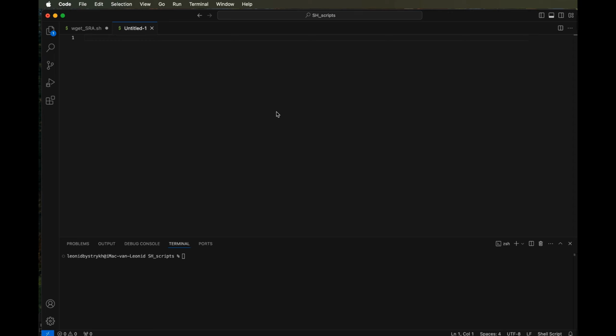Then you have to know some basic elements: command line, then defining variables, then how to do a reference to the variables. For instance, you write a dollar in front, then all names will be printed in one line.